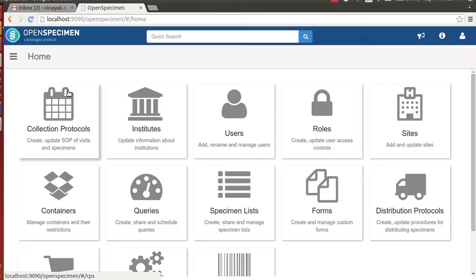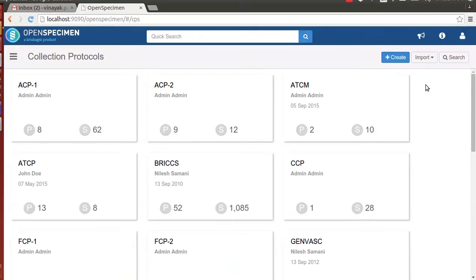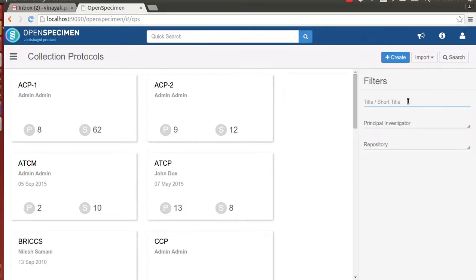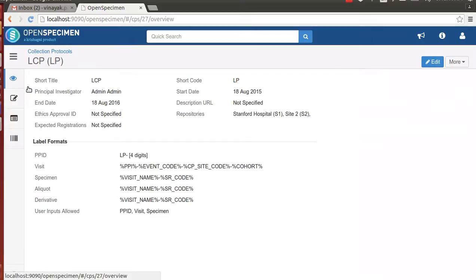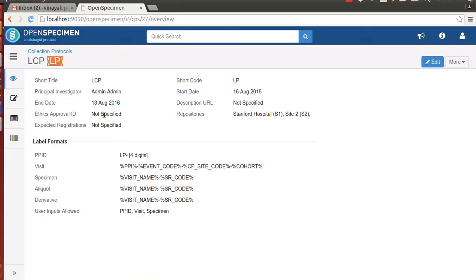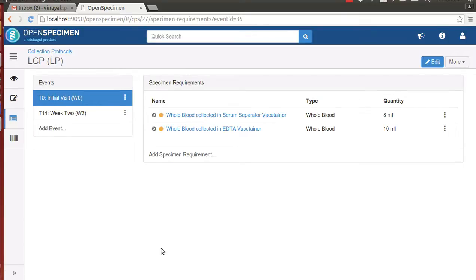Before I demonstrate the workflow, I would like to show the study setup. For this demonstration, I will be using a study called Lung Cancer Protocol. The lung cancer protocol is identified by a short code LP as shown in the brackets. The protocol or the study is setup with two events called Initial Visit and Week 2 Visit.